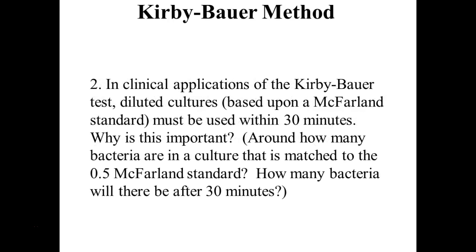The other thing that I did while you guys were taking your test is I set up the McFarland standard and then I had you guys take a look at it. I eyeballed it, but some machines, as we'll talk about later, and we have spectrophotometers in this lab. Unfortunately, they take special sized cuvettes and they don't take our culture tubes. So I'd have to sterilize those cuvettes to be able to use them, which I haven't bothered to do. So we just eyeball it because we don't have to have it 100% accurate for this class. This isn't somebody's patient samples that we're doing.